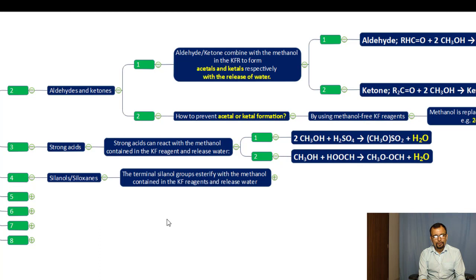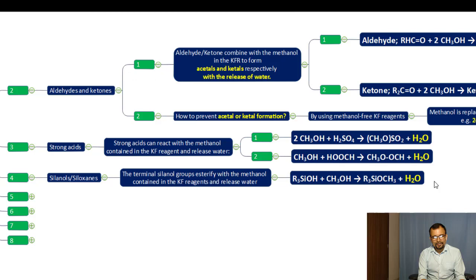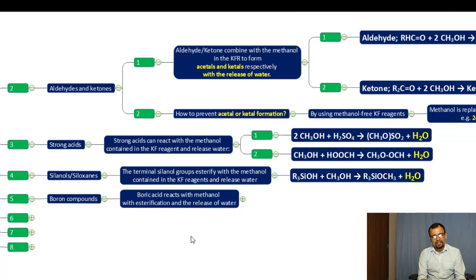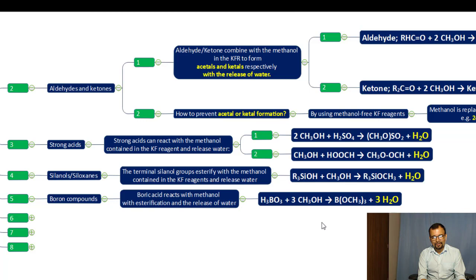The fourth side reaction involves terminal silanol and siloxane groups, which esterify with the methanol in the KF reagent and release water molecules. The Si–OH groups react with the methanol present in the KF reagent and release water. The fifth side reaction involves boron compounds: boric acid reacts with methanol via esterification and releases water molecules.